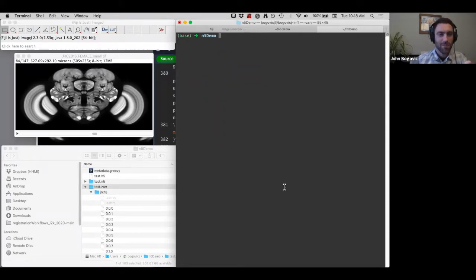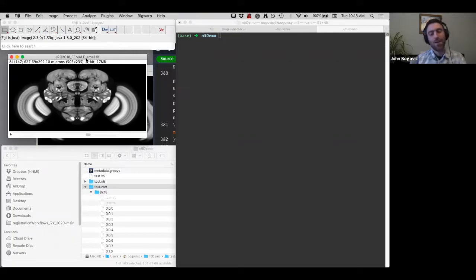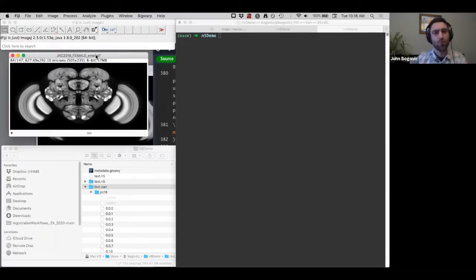Next, I'll just show some of the other small features that show more of the advantages of these kinds of formats, albeit in a little bit of an artificial way. And then maybe I'll show something real afterwards. Specifically, what I claimed earlier was that writing and reading subsets is faster and easier with these formats than in others. So I'll show examples of that. First I'll show reading subsets.